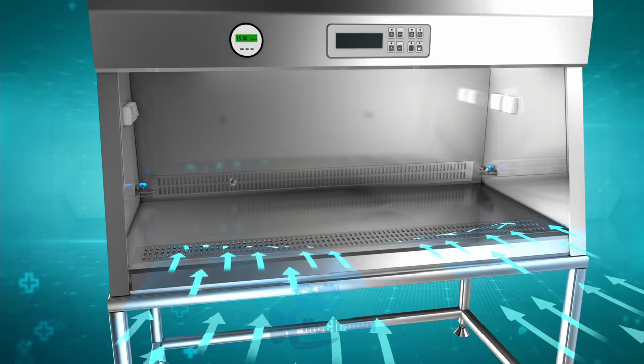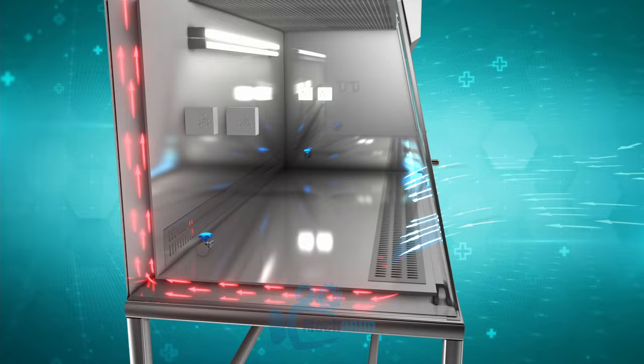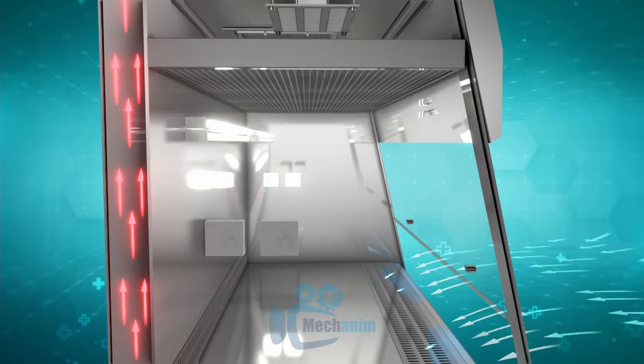Dirty room air is drawn into the front of the cabinet and mixes with contaminated air from the chamber. Contaminated air is pushed below the work surface. Incoming air moves to the plenum located on the back side through underneath the work surface and rises up to the blower.